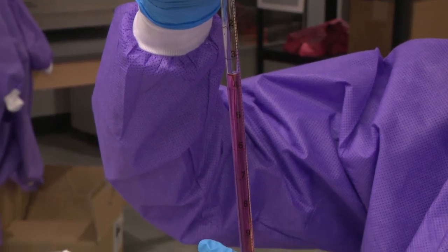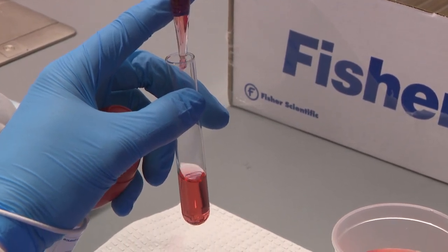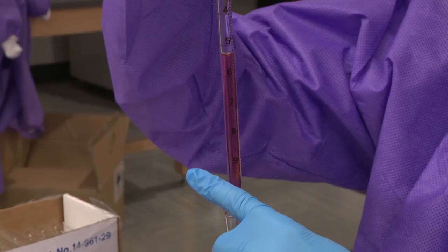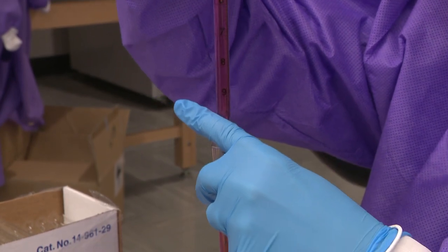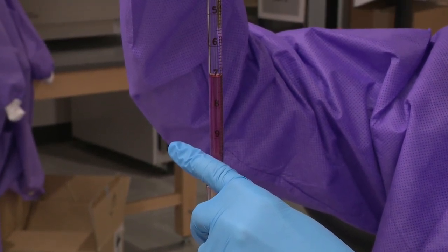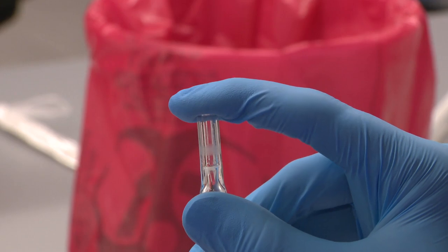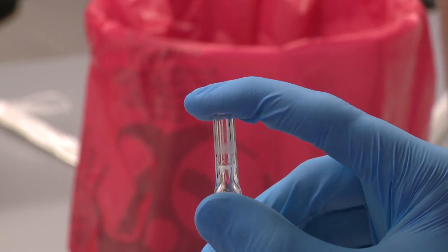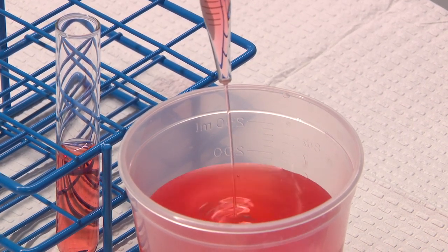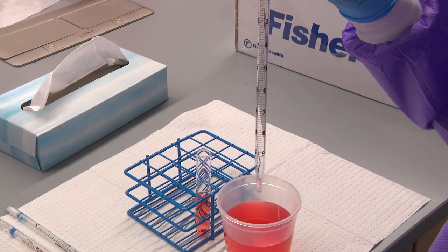Gently and slowly release the pressure from your index finger, allowing the water to flow freely into the test tube until the bottom of the curve of the meniscus reaches the intended line. In this example, our intended line is the 7 ml line. Remember to keep the meniscus at eye level to ensure accurate measurement. Once the meniscus has reached the 7 ml line, use your index finger to apply strong pressure to stop the flow of liquid. Once you have dispensed the desired amount, place the remaining water in the pipette into the original container. Now we will dispose of the pipette.